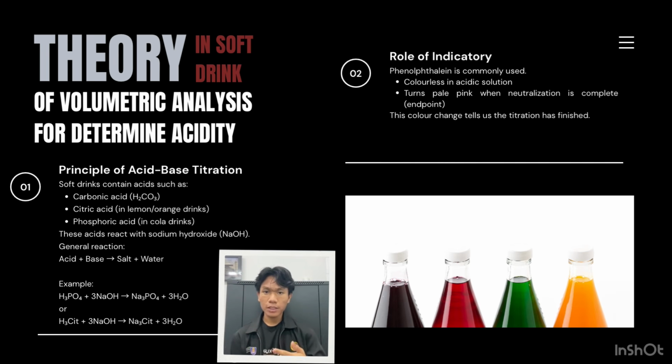During the titration, these acids react with a standard sodium hydroxide, or NaOH, solution. The neutralization reaction can be generally represented as acid plus base gives salt plus water. The reaction continues until all of the acid has been neutralized by the sodium hydroxide.